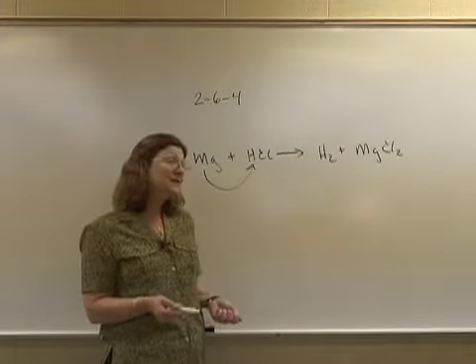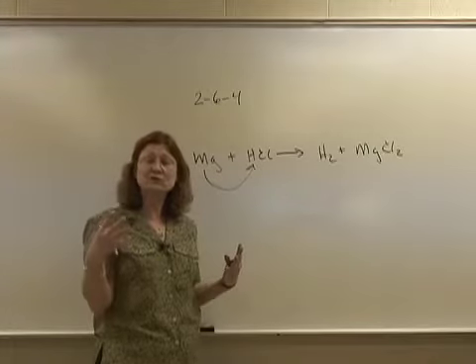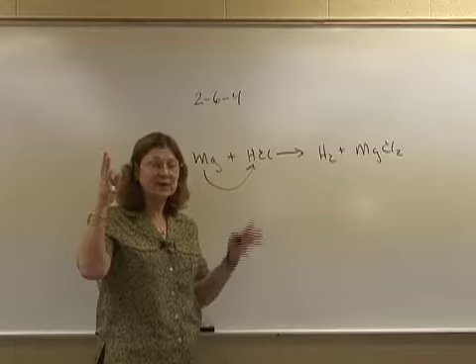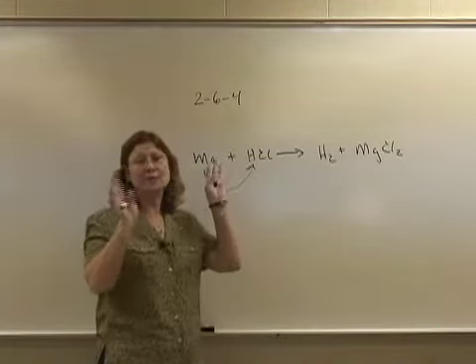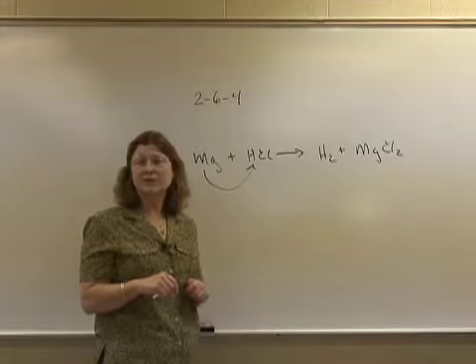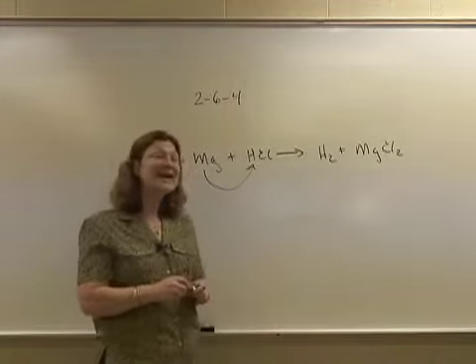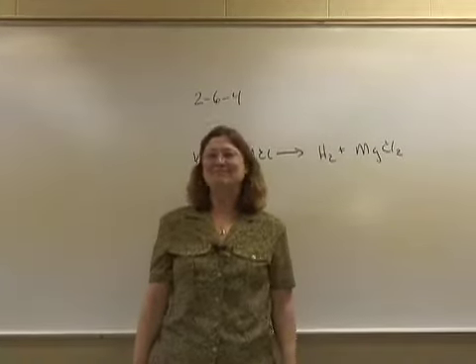Now what the hood does is it takes vapors and gases out of the room, and it filters them so that the chemicals get caught in the filter before the air goes out of the exhaust. So that's what a hood does, and it protects us, and we like that. So I can't wait to see you, and I'll see you in a moment in the lab.